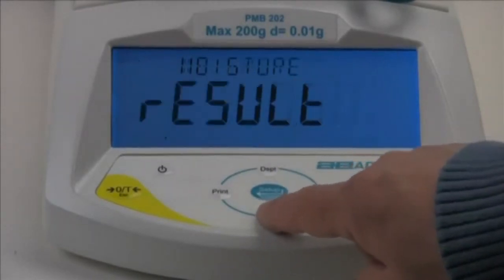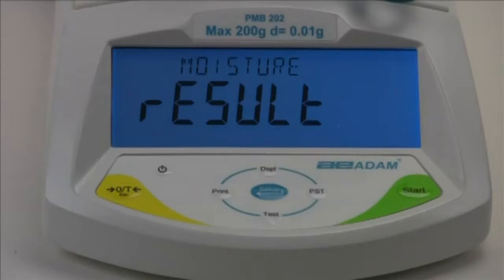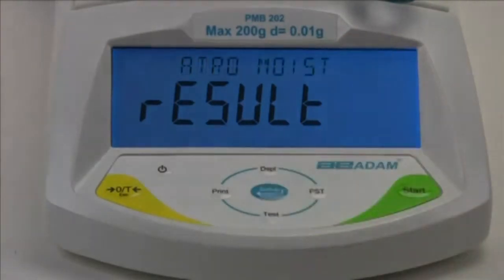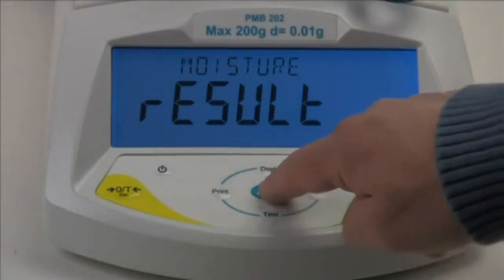Press the test down arrow key to show results with the current setting: moisture, solid, ATRO moisture, or ATRO solid. Using the display up arrow key and test down arrow key you can step through the available types of test results. Moisture displays the percentage of moisture content of the original sample. Solid displays the percentage of solid remaining after moisture has been driven off. ATRO moisture displays the percentage of moisture relative to the dried sample mass. We'll select moisture by pressing the enter key when moisture is displayed.